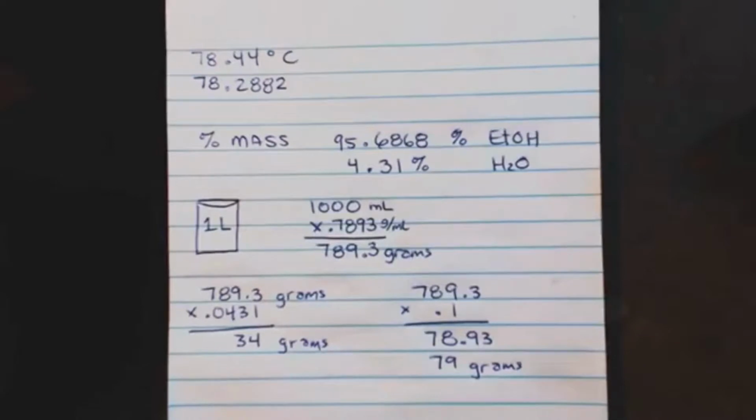When you put this magnesium sulfate in, it's powder. But when it hits any water molecules, it will incorporate them and try to make a crystal lattice, and you'll see it because your stuff will clump up into crystals. Instead of being powder that slides around, it'll clump up into bigger pieces. When it stops clumping up, that means there's no more water to collect.